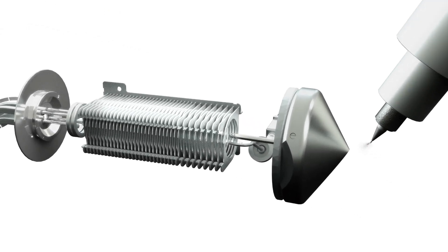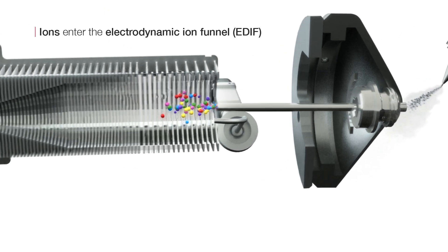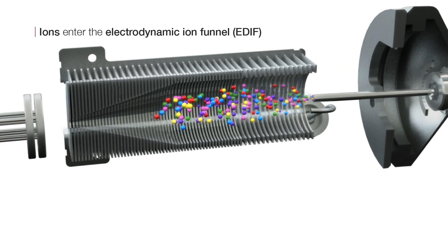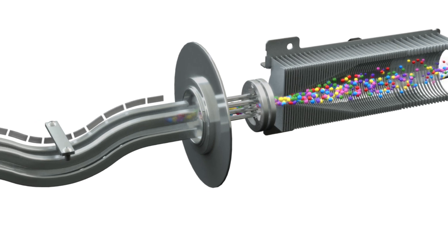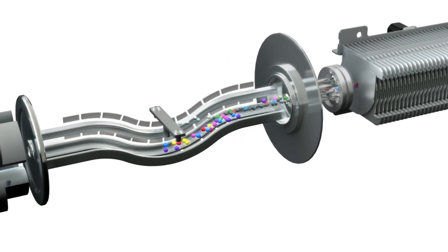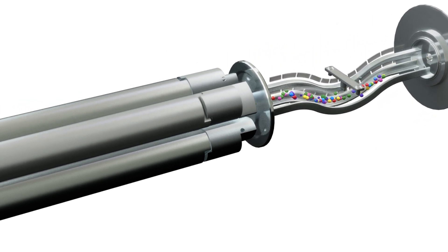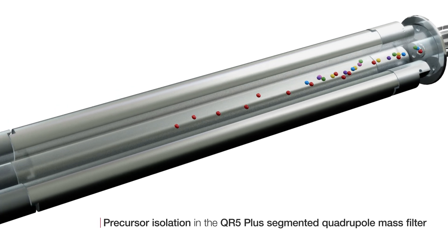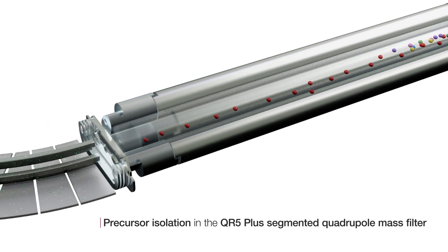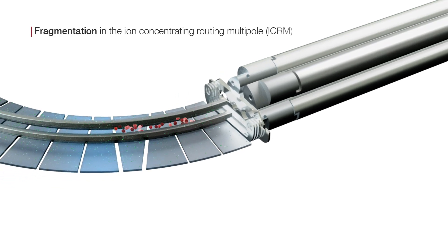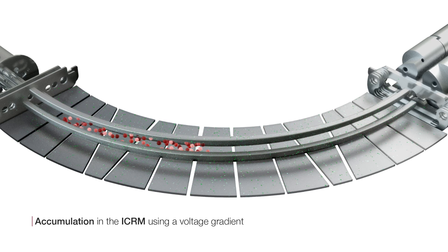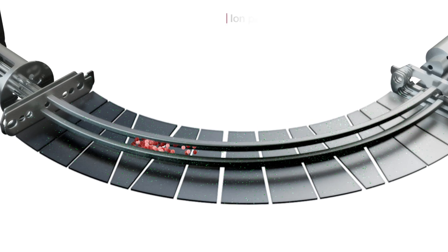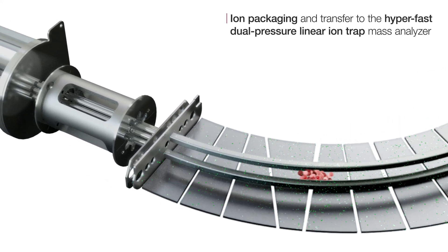For fast, sensitive, targeted MS-MS quantitation, ions move from the high-capacity transfer tube and are focused in the electrodynamic ion funnel. They then move through the advanced active beam guide and are selectively filtered in the QR5 plus quadrupole mass analyzer. In the ion concentration routing multipole, the precursor ions are fragmented and accumulated using a voltage gradient. The Stellar Mass Spectrometer's ICRM uses dynamic automatic gain control to manage accumulation times, which increases utilization rate and data quality.